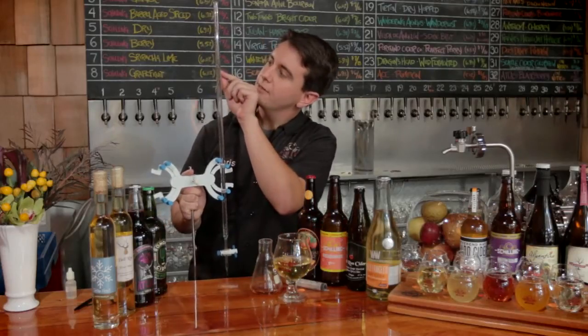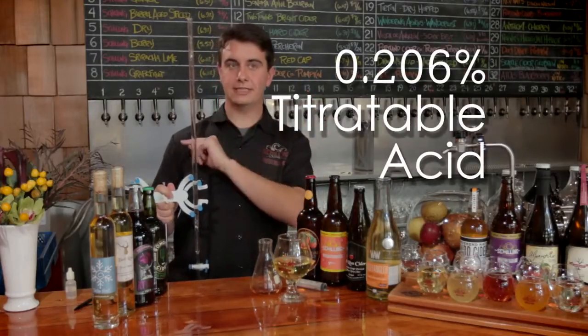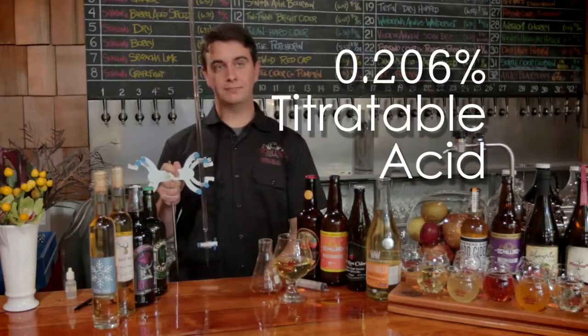That looks like it right there — we've got this beautiful sunset color. Now that we've hit this color change point, we will be looking to see how much of the sodium hydroxide has been used in the reaction. I can see my reading here — it's about 10.3 milliliters. To convert it to the final percentage, you double it, so it becomes 20.6, and that will be the number to the right of the decimal point: 0.206% titratable acid, which is on the lower side of acidity.